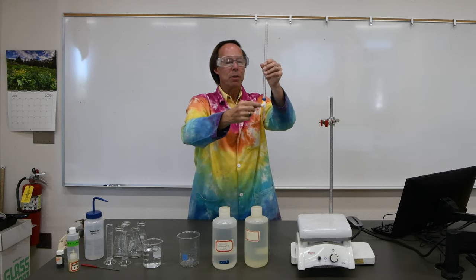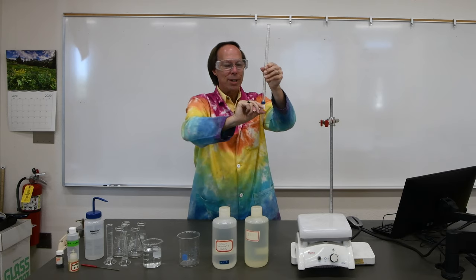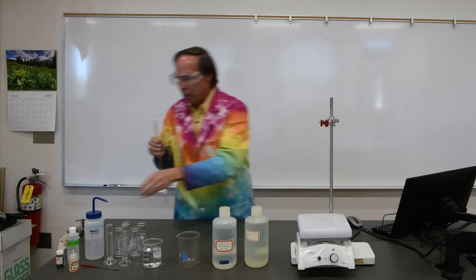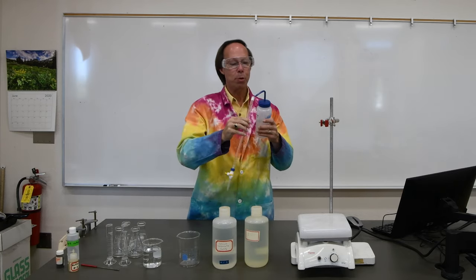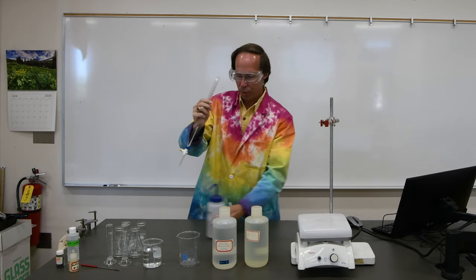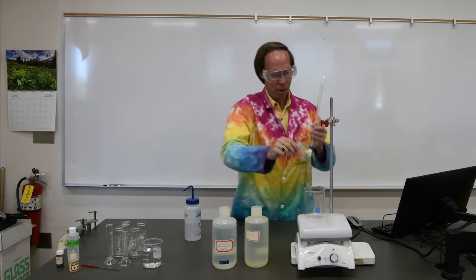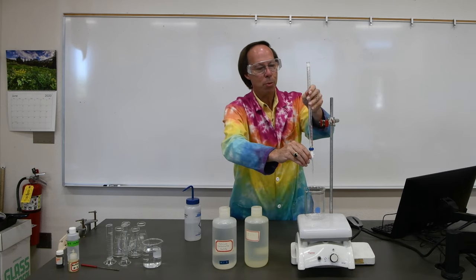If you move it to the vertical position, it lets liquid run through, so we want to make sure it's horizontal to start with so that no liquid gets out. The first thing we'll want to do is to rinse it out with some water. So I'm going to put some water in here, and I'm going to swirl the burette around. I want to rinse the side down very well, and then we'll just have a waste beaker here that we can rinse it out. So we'll open the stopcock and we'll let the water drain out.